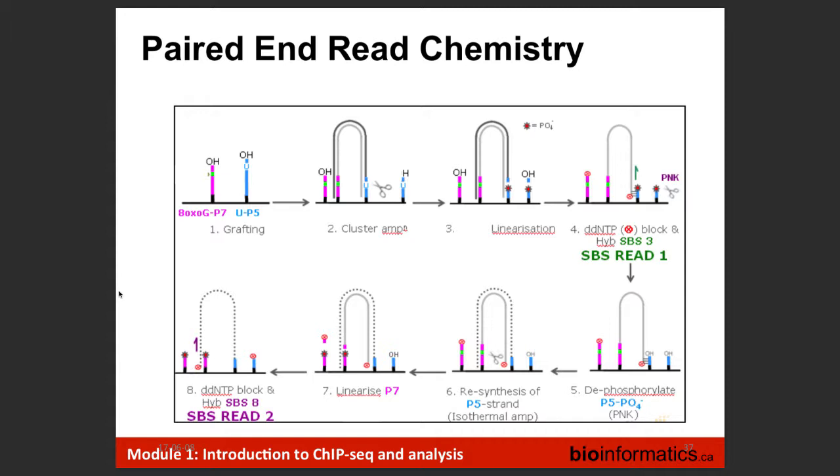And in other cases, like retroviral elements, paired end reads can be very important. So if you're interested in repetitive regions of the genome, and maybe some of these are the regions that you're talking about, we can leverage the paired end. If you've got a retroviral element found 100 or 1,000 times in the genome, when the aligner places read one correctly in the retroviral element, it doesn't know which retroviral element it is in the genome. The way aligners handle that is they just report one randomly. So they'll say, I know it's mapping quality zero, it's in 100 places in the genome, I'm going to place it here.